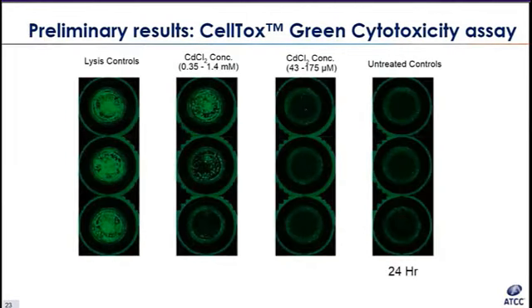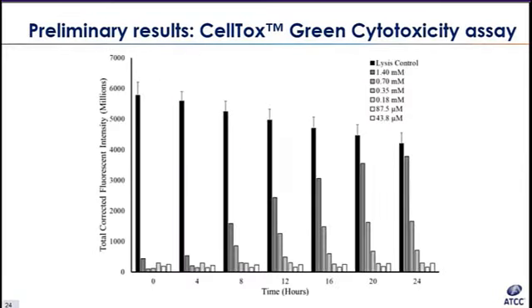Here, we graphically represent the data from the previous slide to show a dose-dependent response to cadmium chloride exposure. The x-axis shows the time points where measurements were taken, with each value corresponding to a total fluorescent response that has been corrected using the untreated blank controls.